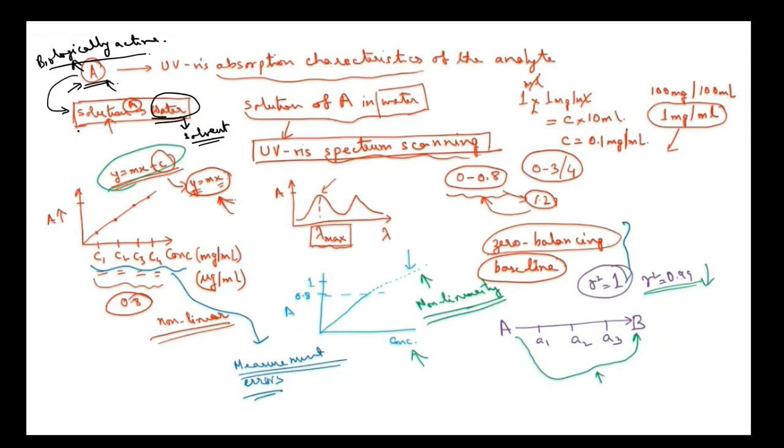Now with this solution, we will go for UV visible absorption measurement. How will we do it? We will use the wavelength scanning method.